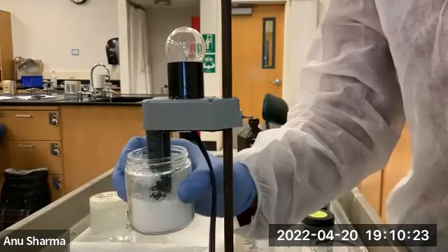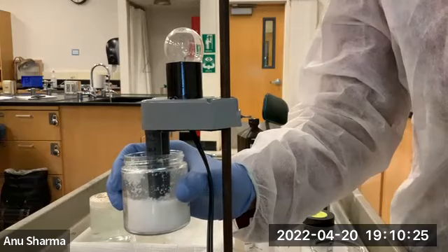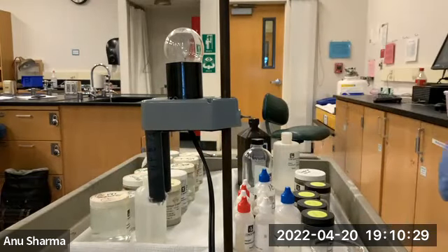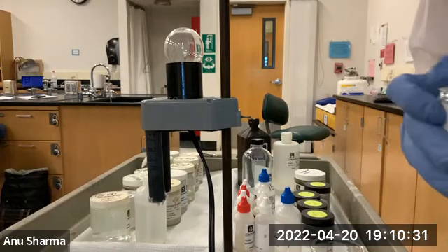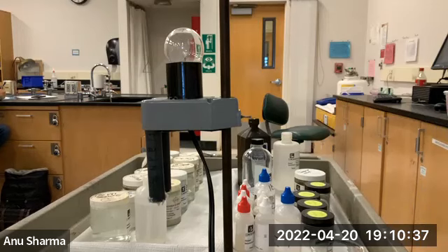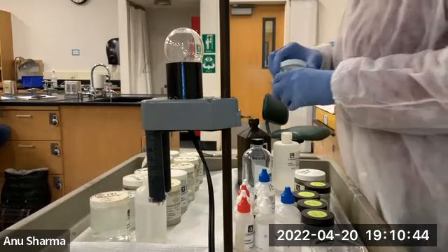You look at it here, nothing is happening. So in a solid form, sodium chloride is a non-electrolyte, and you are going to write down the major species is NaCl as a solid, and the minor species is none. Now comes the NaCl aqueous.